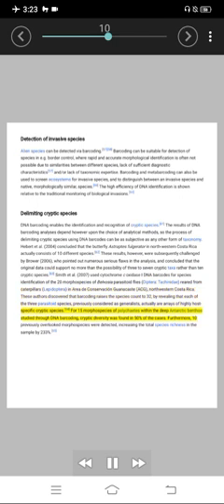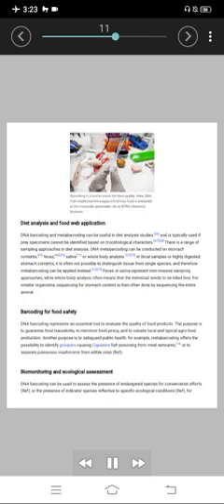For 15 morphospecies of polychaetes within the deep Antarctic benthos studied through DNA barcoding, cryptic diversity was found in 50% of the cases. Furthermore, 10 previously overlooked morphospecies were detected, increasing the total species richness in the sample by 233%. Barcoding is a tool to vouch for food quality. Here, DNA from traditional Norwegian Christmas food is extracted at the Molecular Systematic Lab at NTNU University Museum.